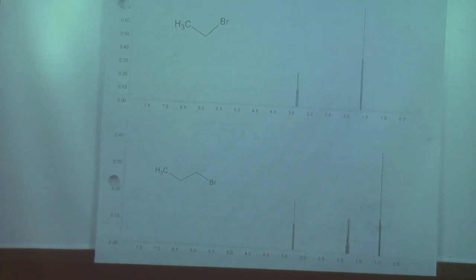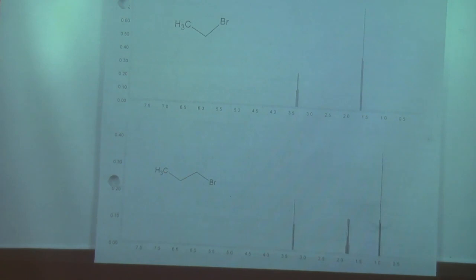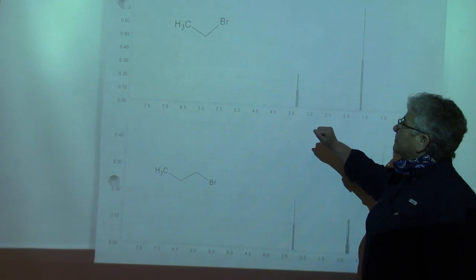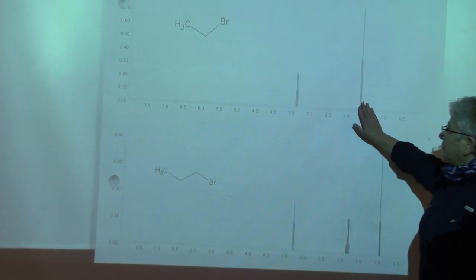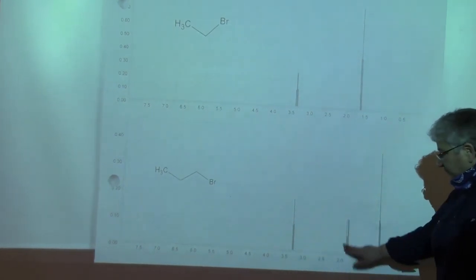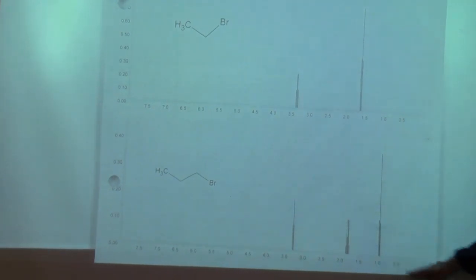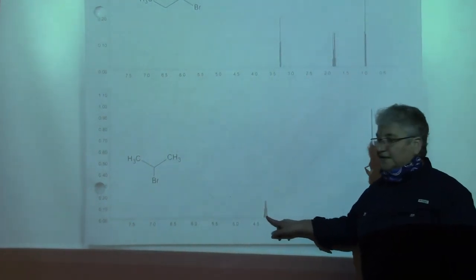So come back. It's hard for me to see here, but if you look closely, you should see that there are 4 peaks here, and 3 peaks here, and 3 peaks here, and maybe around 6 or so in here, and 3 peaks here. And then in the bottom spectrum, you should see 2 here and 7 here.